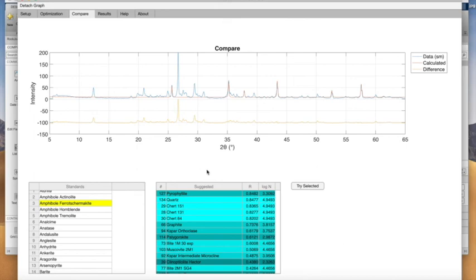In any case, it lists them in that order, and then it also has this other number here, log n. That's just the number of locations where that mineral appears in the mineral evolution database. There are something like 300,000 different locations where people have reported what minerals are there. I've color-coded the different lines in this table based on that number, so a higher number of locations means a brighter color.